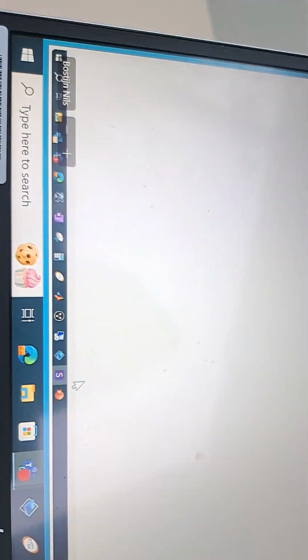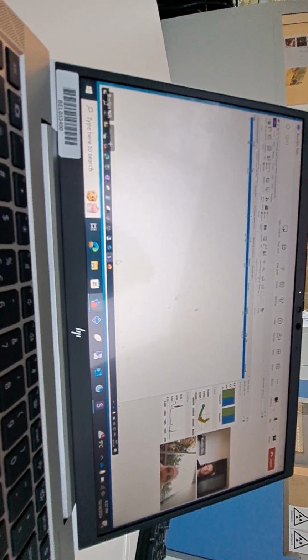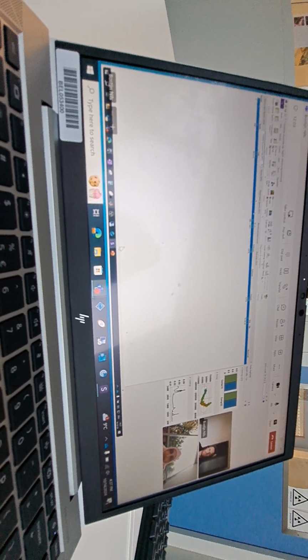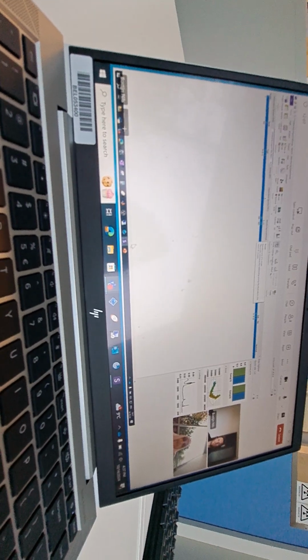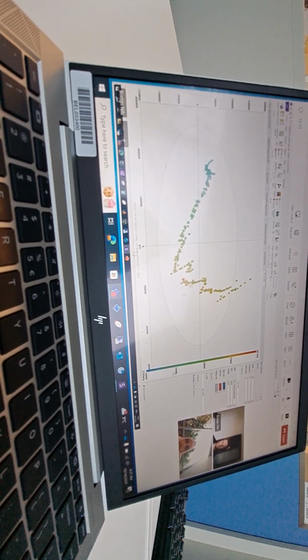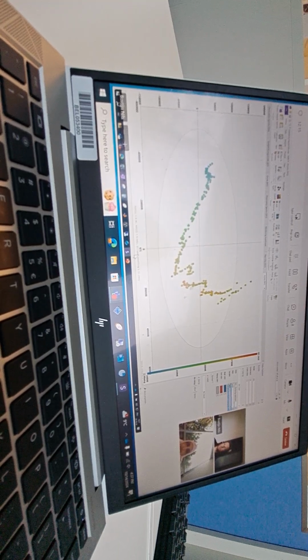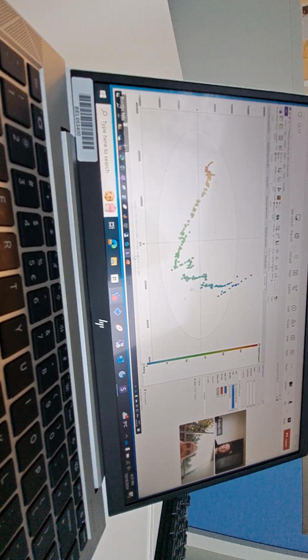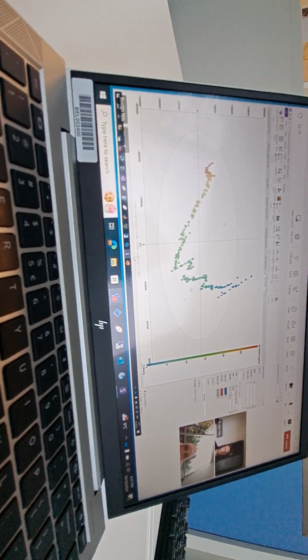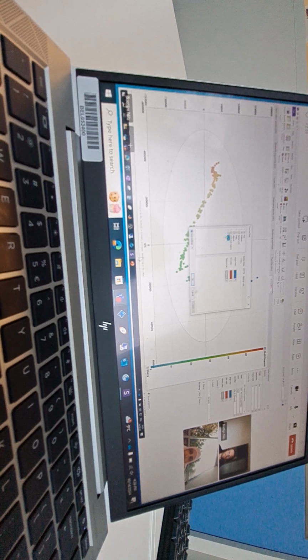And then the models. But yeah, maybe if you first know how to work with the spectra, then the models can be the next step. But okay, fine. If you have a scores plot, it's the same principle. You can modify the view. You can color according to the time point. That's the same as for the spectra. If you right click, format plot, you can also change everything.